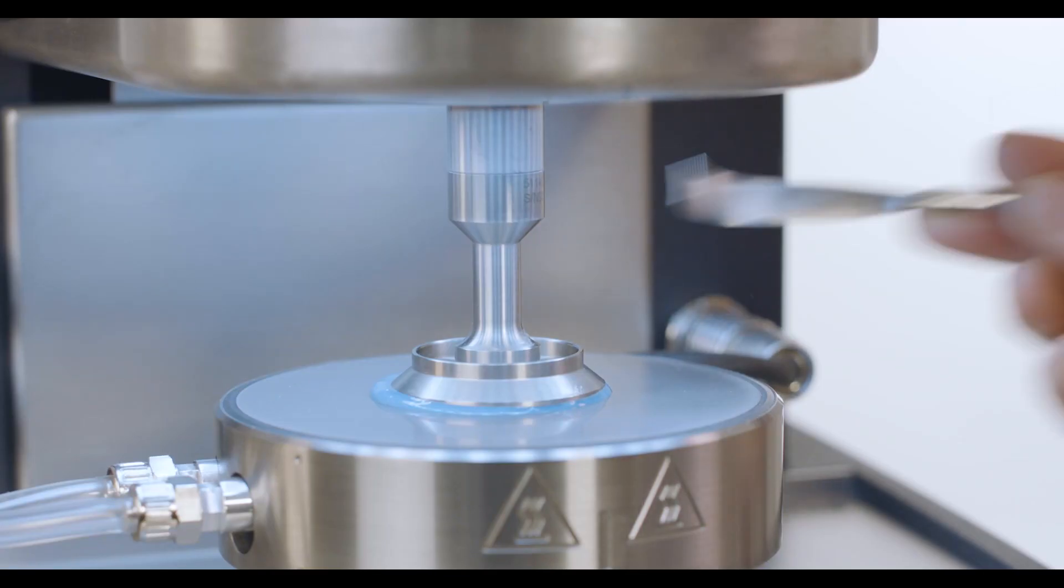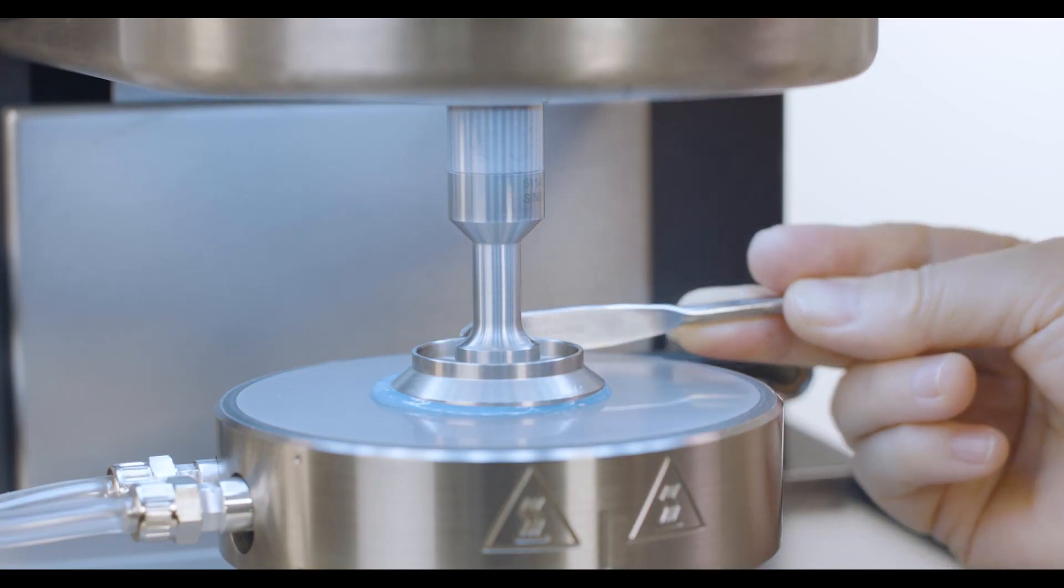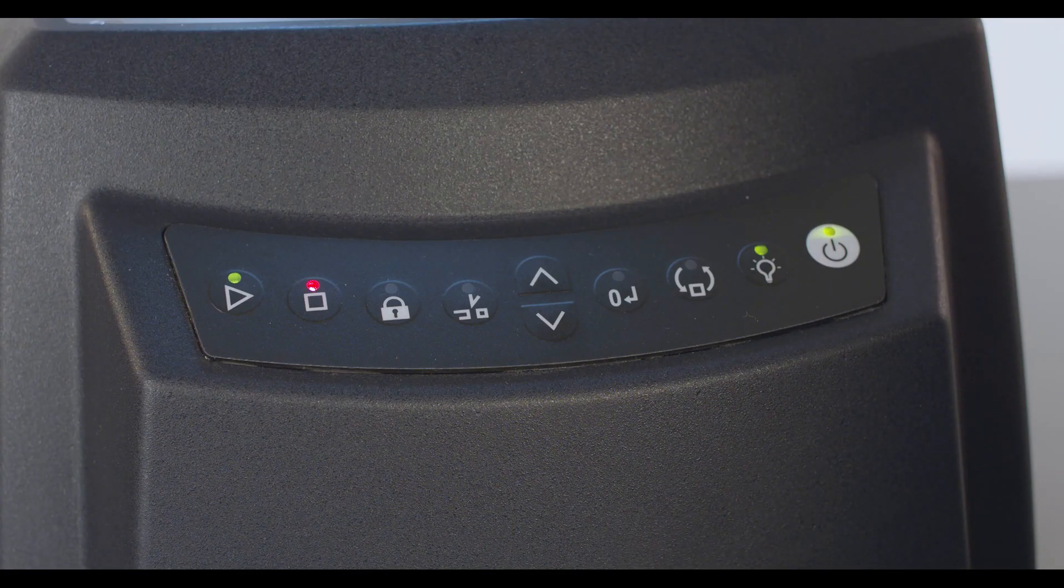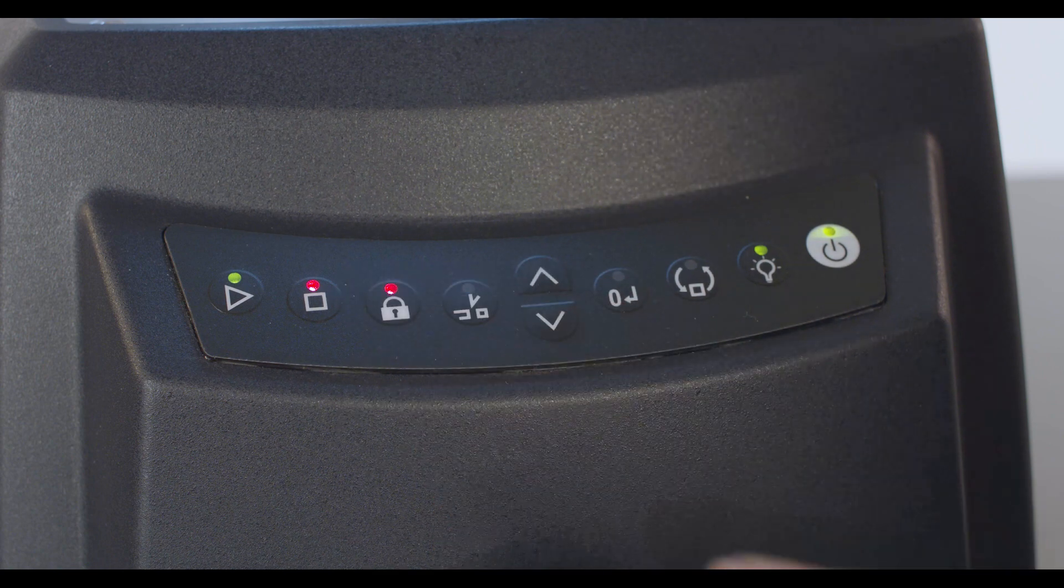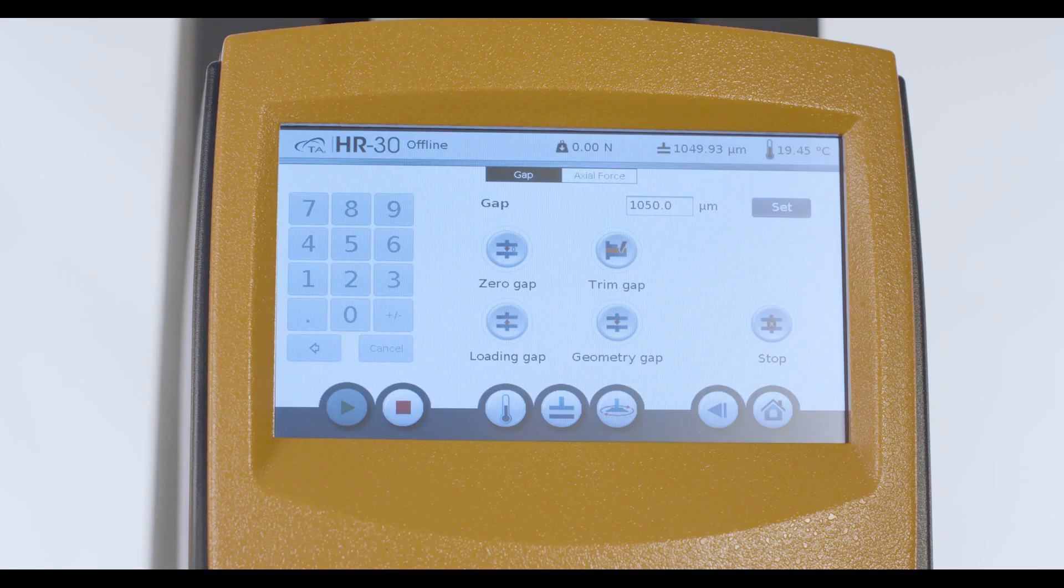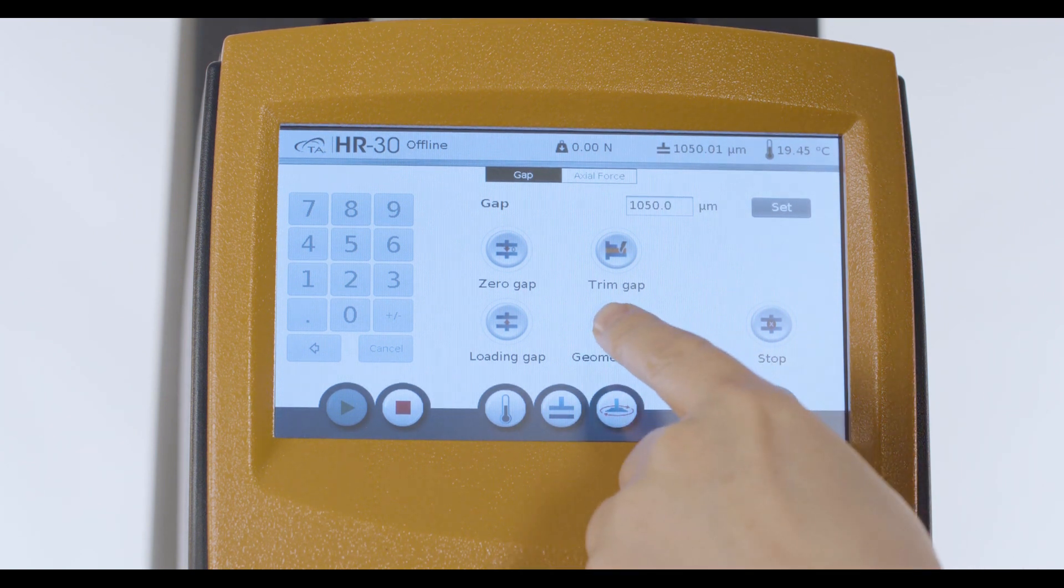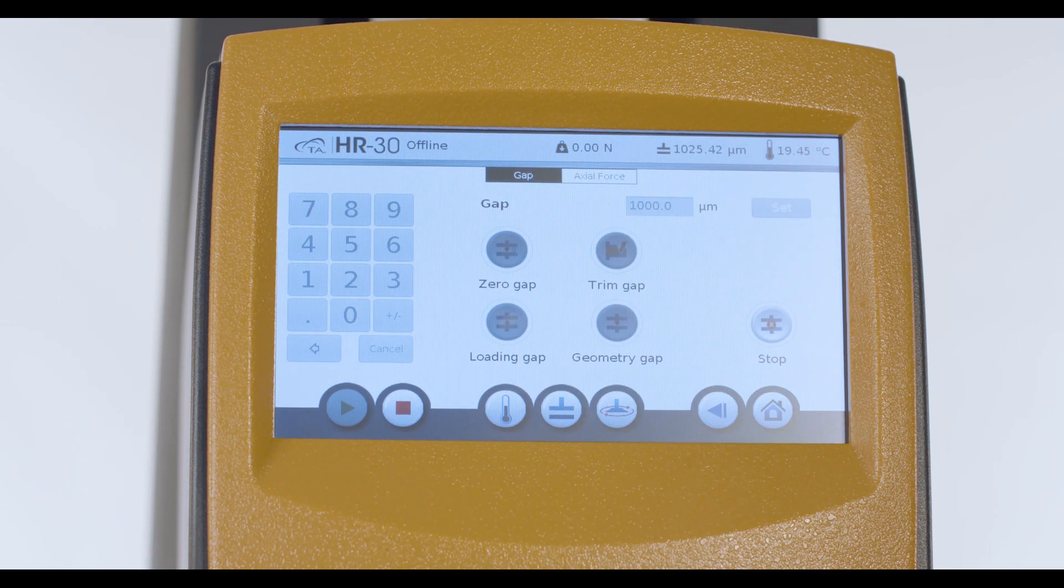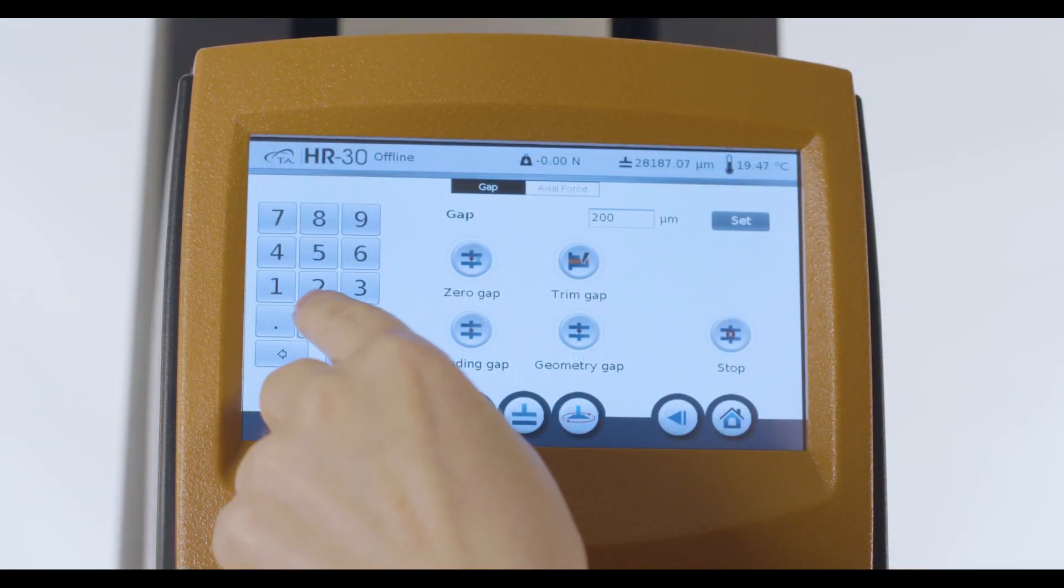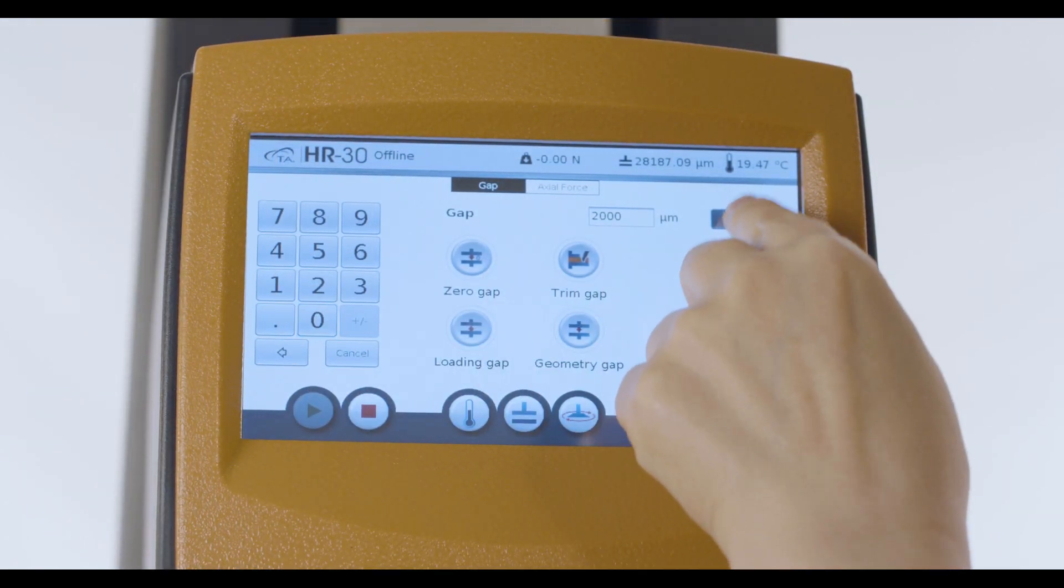Trim the excess amount of sample. To prevent the geometry from rotating during trimming, press this lock button from the instrument front panel. After trimming, use this button from the touch screen to go to the set measurement gap. You can also manually type in a target gap you wish to use.